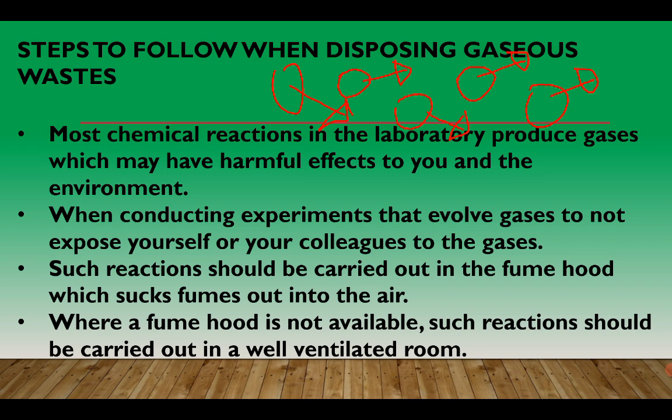All right, so most chemical reactions in the laboratory, as you may have learned, produce gases which may have harmful effects to you and the environment. So what do we do when we are carrying out chemical reactions that produce gases?